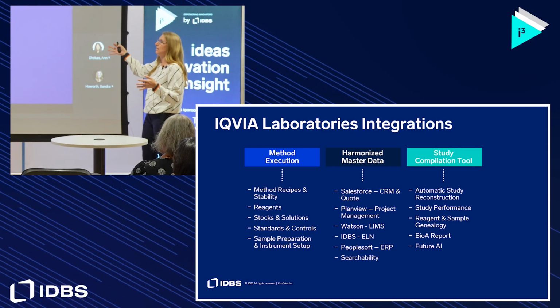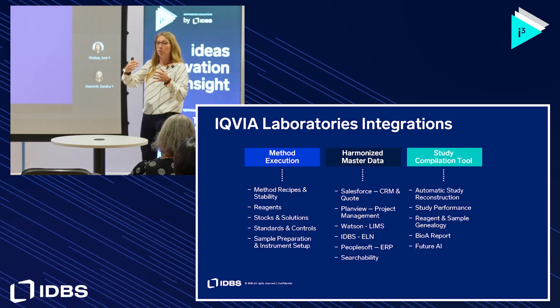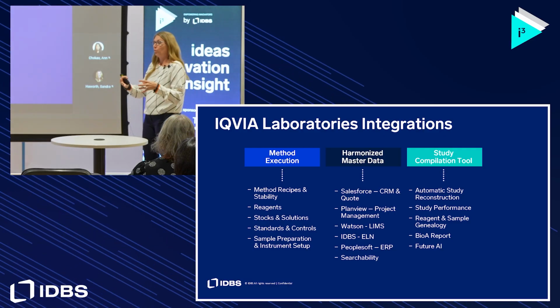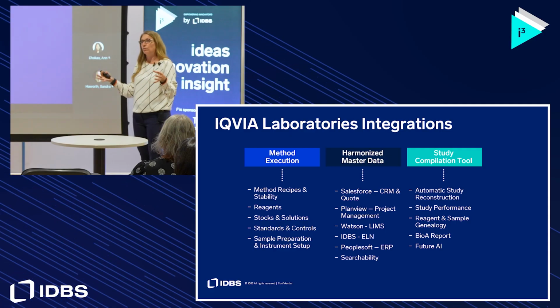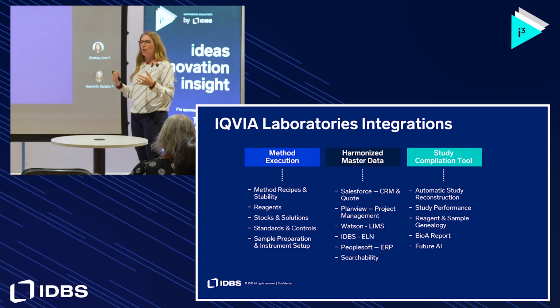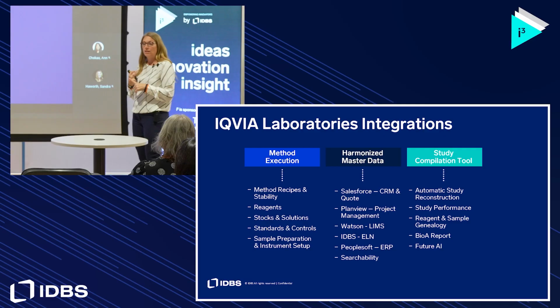So you don't have to do this even at the end of the study. You could keep a running log, like create one experiment, run your query, run 10. How is the assay performing today? How is the assay performing in a month? We do run large clinical trial studies, so it's a neat tool to be able to, from a project management standpoint, if they don't understand how to use all the templates, that's okay, but they can at least see all of the runs that have been executed.